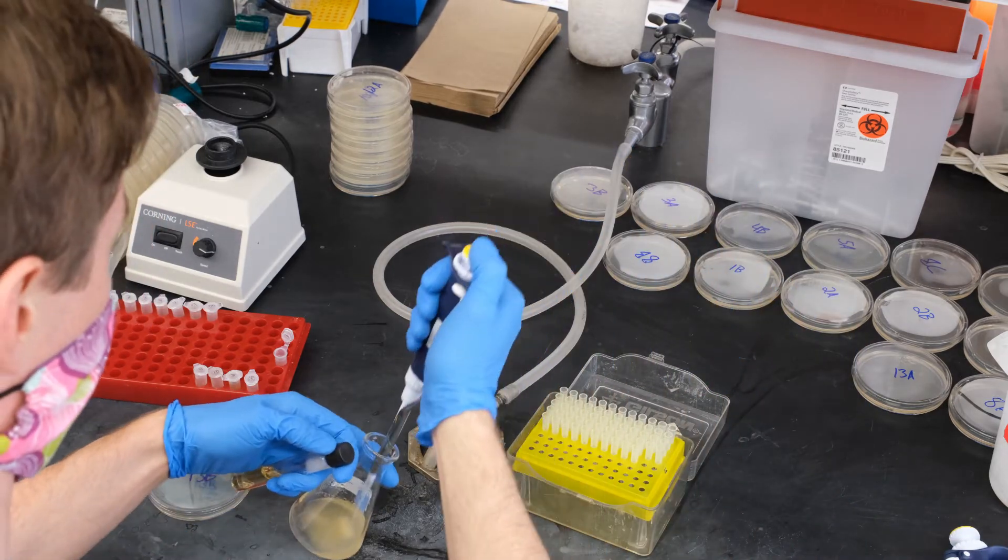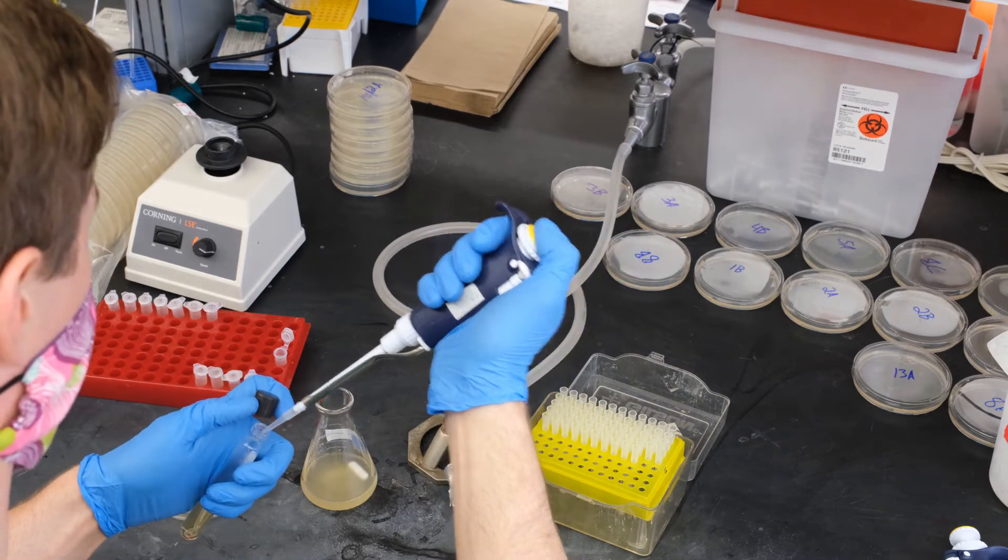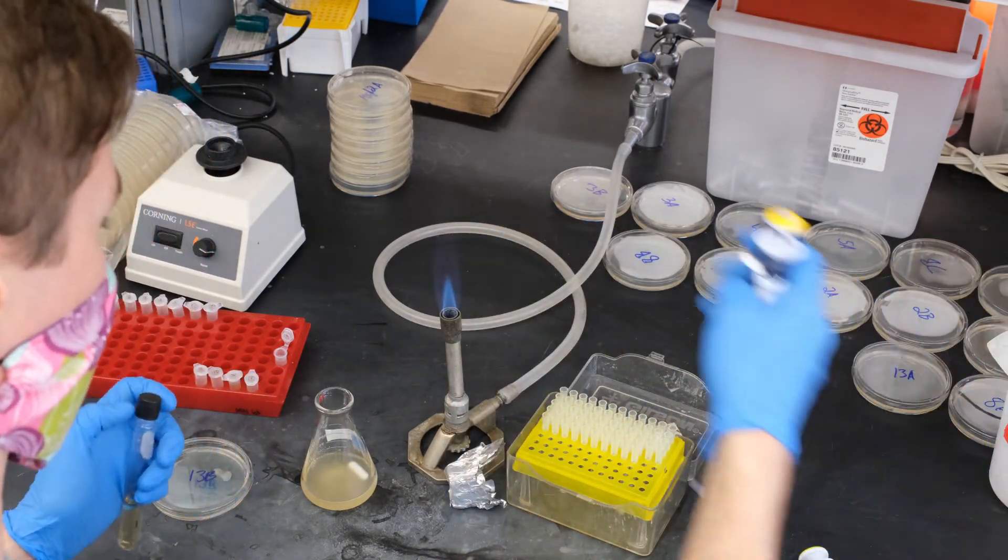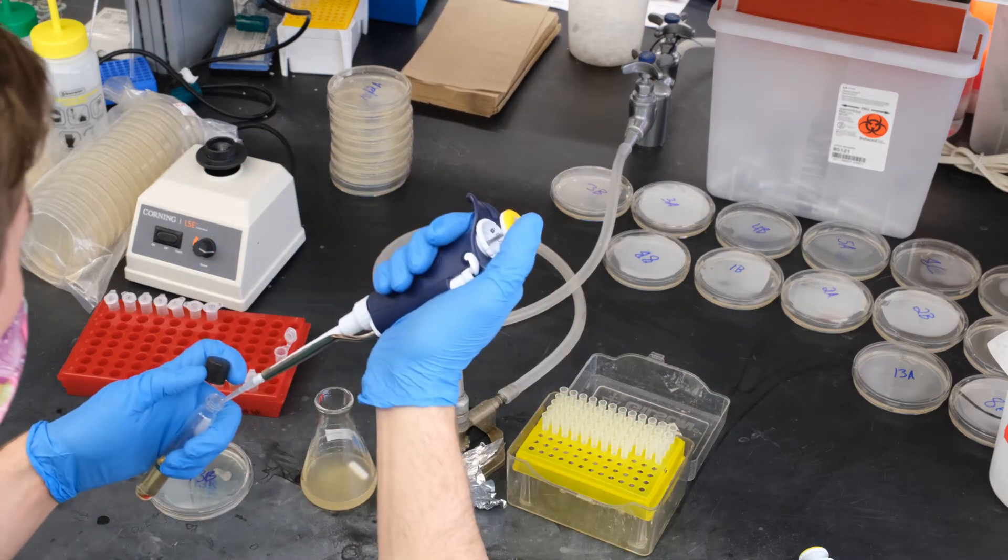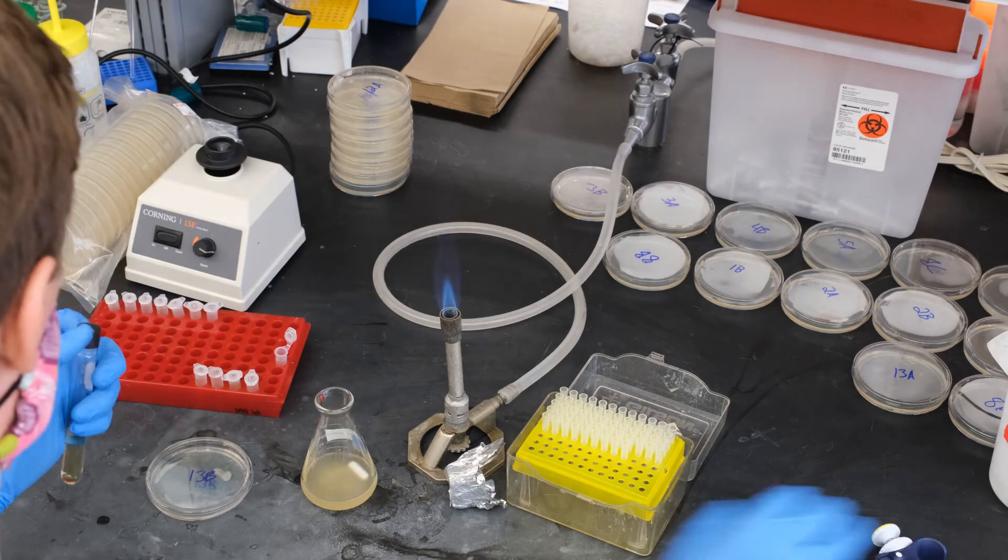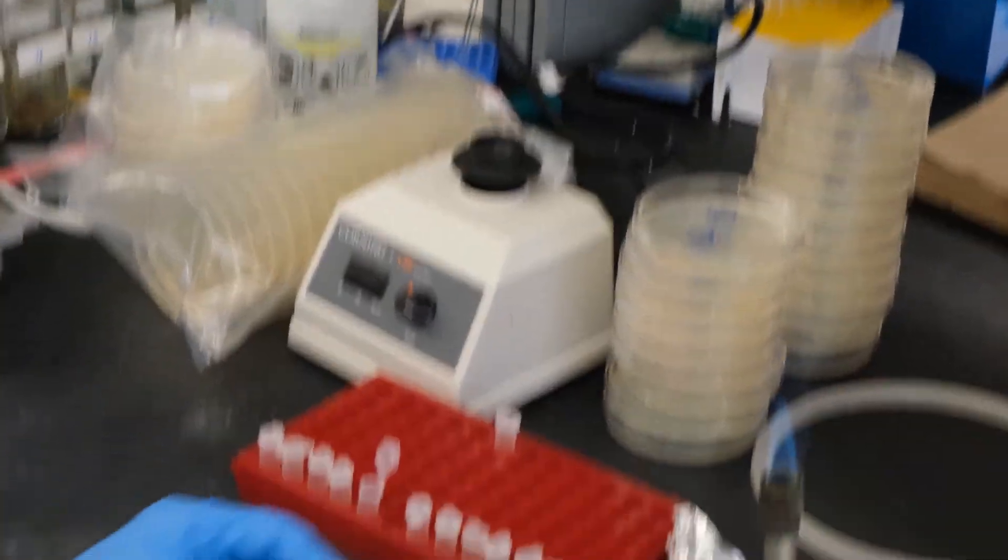When the plates and the molten agar all reach appropriate temperatures, grab your growing bacterial overnight culture. Add a small amount of fresh bacterial inoculum and a portion of your cleared phage extract to a tube of soft agar. Quickly vortex and then pour the tube over a hard agar plate.